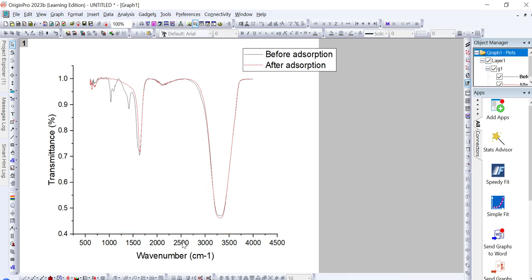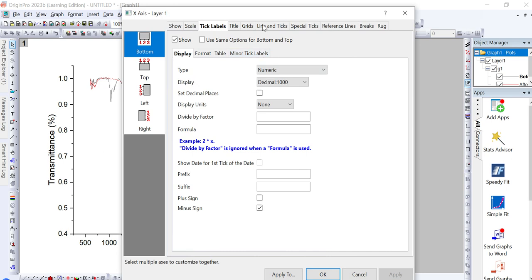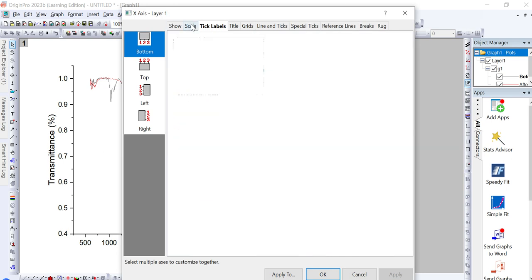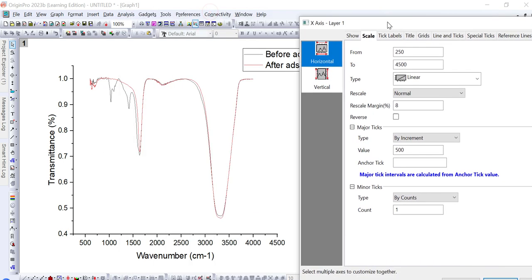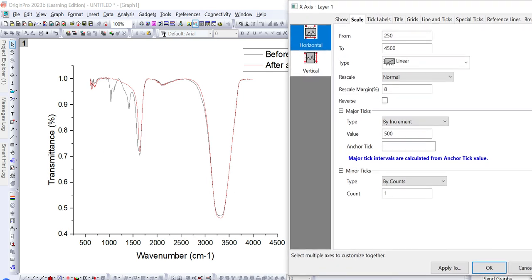If you want to reverse the order of x-axis values, double-click on any of the axis values and a dialog box will appear. Click on Scale. In any FTIR graph, it is better that x-axis values start from the highest value and end on the lowest value. In this case it starts from the lowest, so we need to correct this by reversing its order.